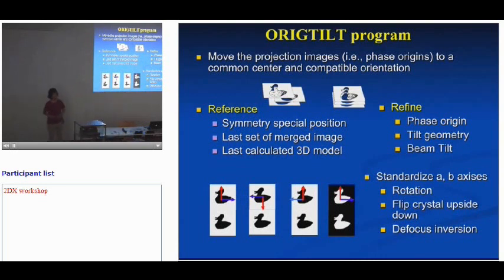Okay. While you are doing this, there are a few things you need to consider. This actually comes from the fact that when we acquire our data and when we assign the axes, there is certain information we don't know yet. So you may call it a mistake, or just a convention decision that you put in to determine your lattice, that you actually need to make adjustments for. So these are really big changes.